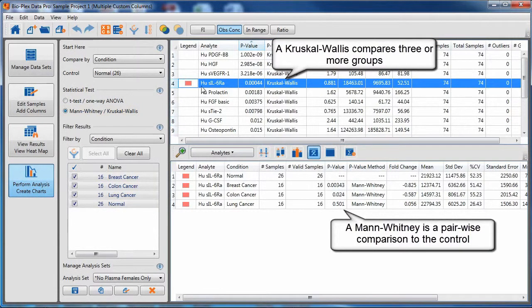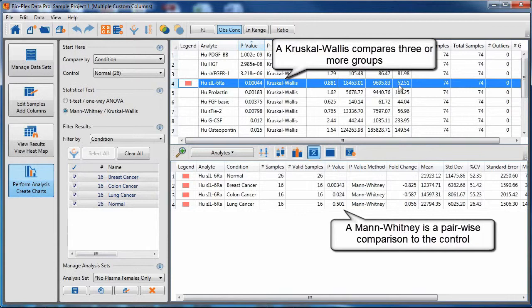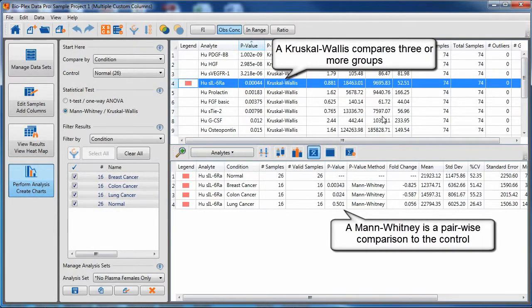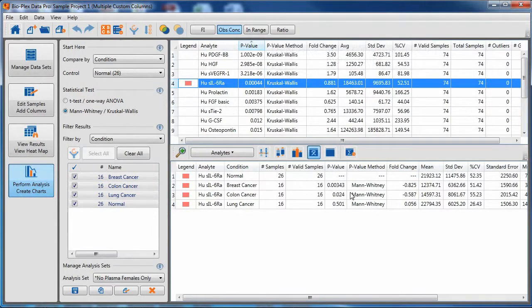Similarly, Kruskal-Wallis compares three or more groups, whereas Mann-Whitney is a pairwise comparison of your control to your experimental group.